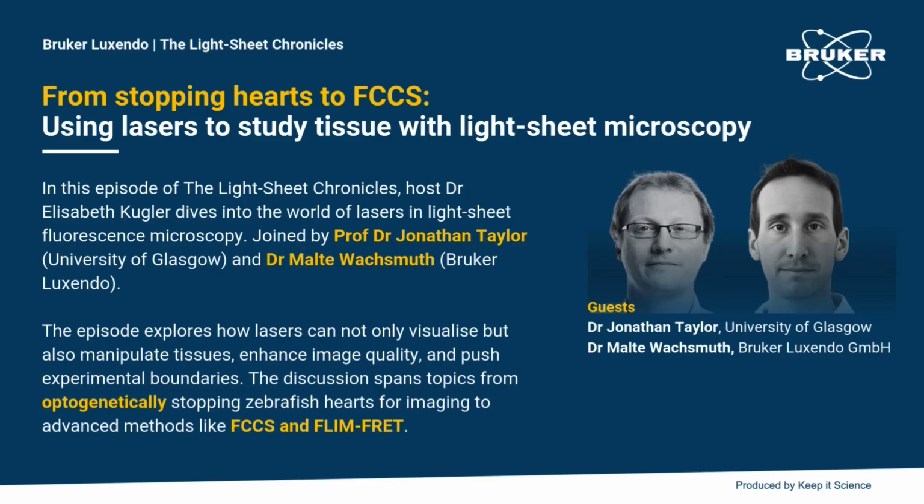Another less obvious and maybe a little bit more hidden artifact is that in light sheet microscopy, the illumination is not homogeneous across the field of view. You're illuminating, like I said already, from the side, typically in most cases with a Gaussian beam. And the properties of a Gaussian beam are such that you have a beam waist where intensity is the highest and also the thickness of the beam is the thinnest, but it's converging towards the objective lens and diverging away from the objective lens so that you have really an inhomogeneous distribution of intensity and beam thickness.